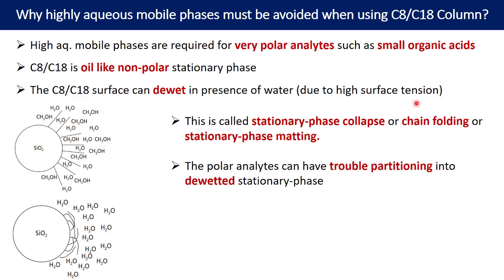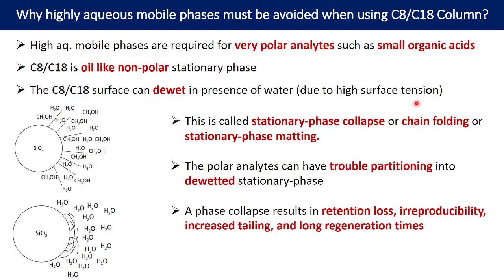When the stationary phase is de-wetted and collapsed, polar analytes will have trouble partitioning into it. As it is collapsed and not open, none of the analytes can interact with the stationary phase. Phase collapse results in retention loss, irreproducible retention time, and increased tailing. It also takes more time to regenerate the column back from the de-wetted to the wetted state.